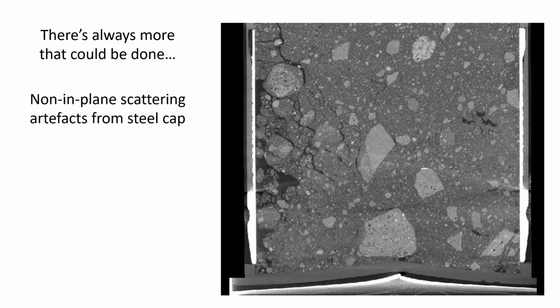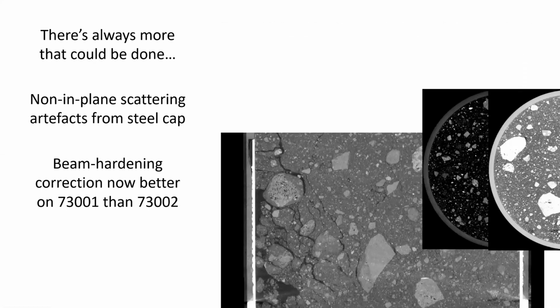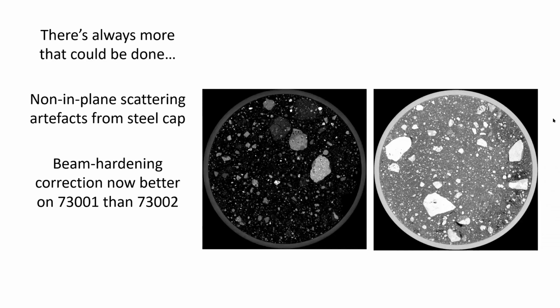we had to stop someplace, but there are still some artifacts left that, if anybody's going to use these data for this kind of purpose, like trying to infer soil densities or porosities, you need to keep in mind. For example, these beams right here are scattering artifacts because of the thick metal and the change in thickness at the interface, certainly a scanning artifact.